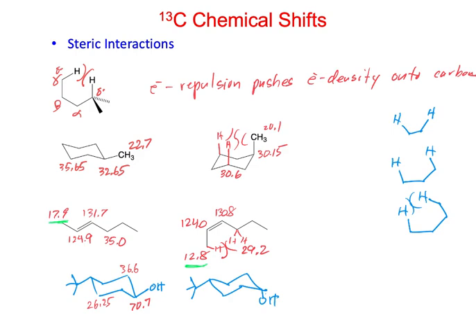It's axial. There's some sterics here, even with the alcohol. So this gets pushed up to 65.1, so like 5 parts per million upfield. 34.05. So that one isn't feeling something there. And this one is at 21.5. So likewise, it moved upfield almost 5 parts per million or something. Another place where it can be important is in something like retinal. So these come from carotenoids.